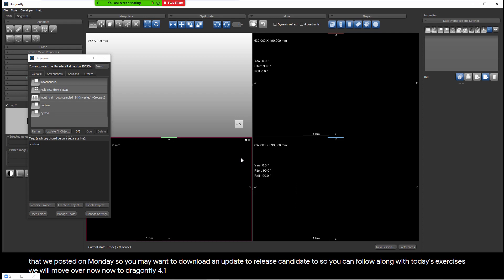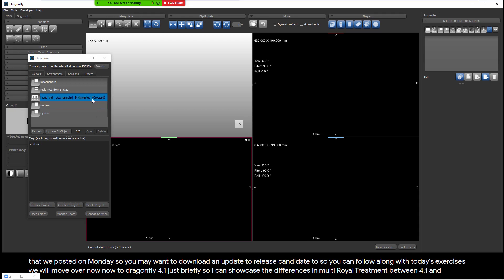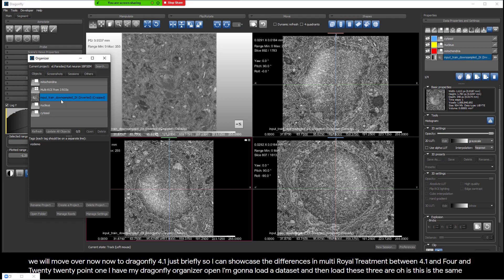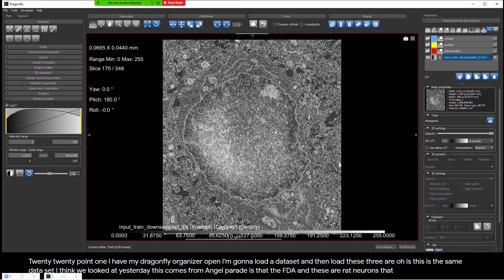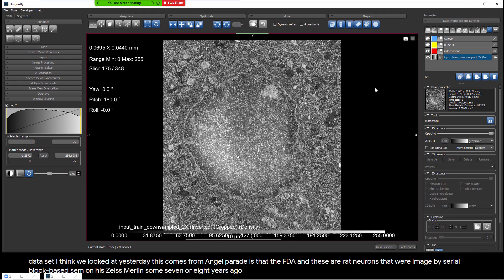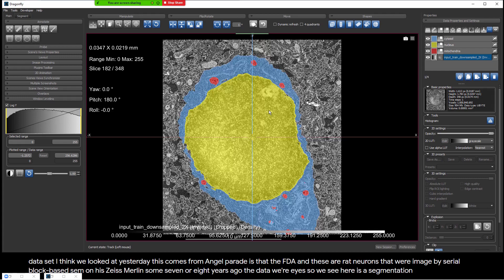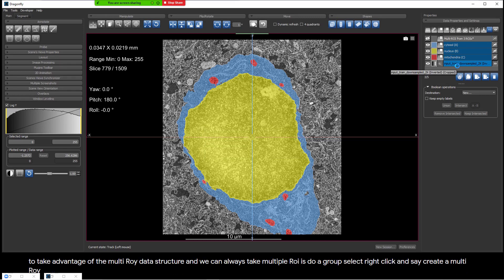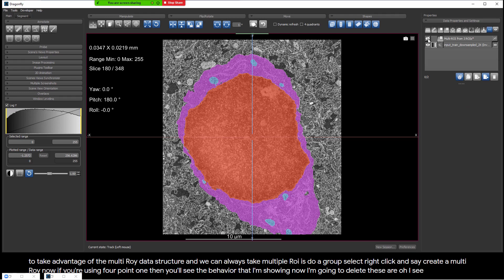We'll move over now to Dragonfly 4.1 briefly to showcase the differences in MultiROI treatment between 4.1 and 2020.1. I have my Dragonfly organizer open. I'm going to load a data set and then load these three ROIs. This is the same data set we looked at yesterday — it comes from Angel Paredes at the FDA, and these are rat neurons imaged by Serial Blockface SEM on his Zeiss Merlin some seven or eight years ago. I can turn on these ROIs and we see a segmentation where I might want to take advantage of the MultiROI data structure.